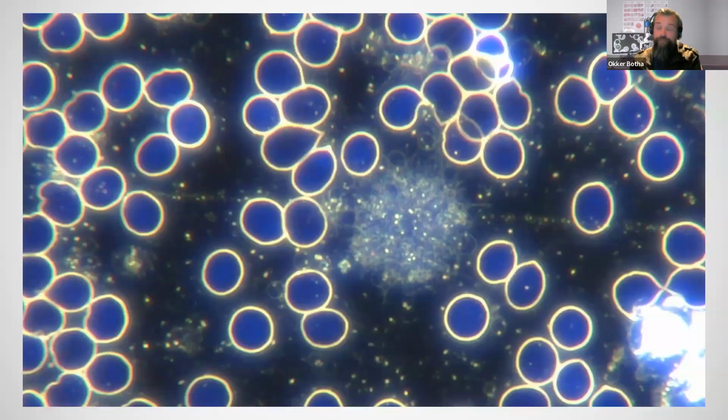Right, so another proper dark field image with the HDMI LED microscope. We have some interesting things here. We have a group of thrombocyte aggregation in the center of the image, and some bubble shaped structures around there as well. This is a fairly strong indicator for leaky gut syndrome, something that we encounter very frequently in practice, and often intestinal permeability is the underlying issue in many chronic illnesses.